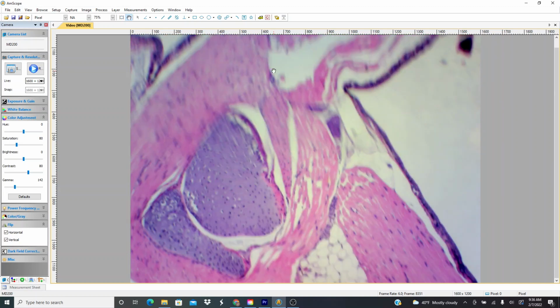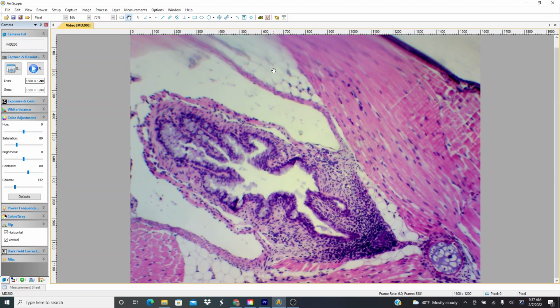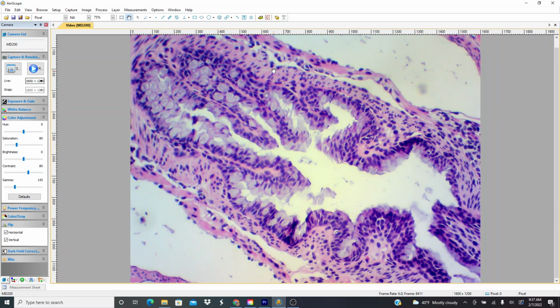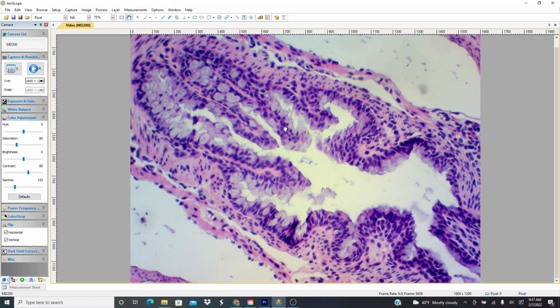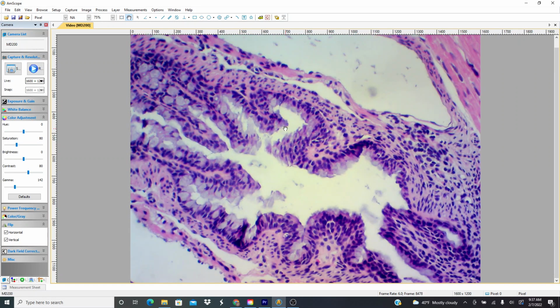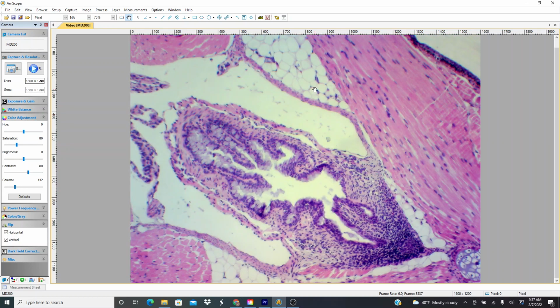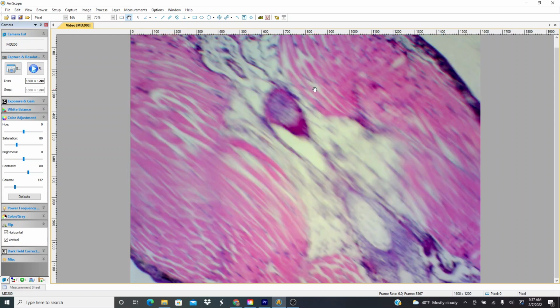So back to the body. There's a structure here. I'm not sure what it is. But it's lined by these sort of mucus cells. Again, it's got this cell lining. It looks like a sort of gastrointestinal tract lining, but usually in the colon of humans, all the cells become mucus or goblet cells. So I wonder if this may be the colon of a salamander. Of course, I don't know. I don't even know that this is a salamander, to be frank. Hopefully somebody will see this and let me know what I'm missing.